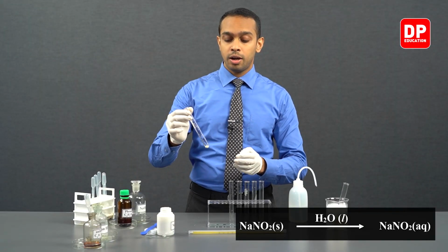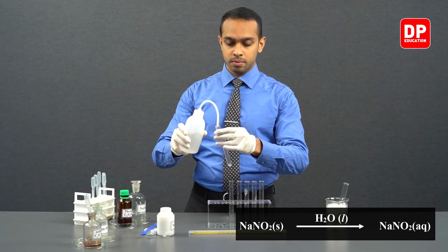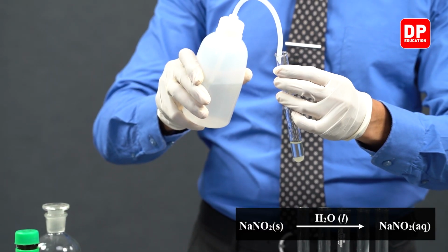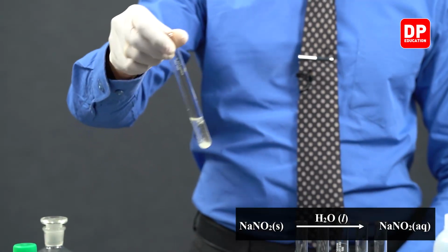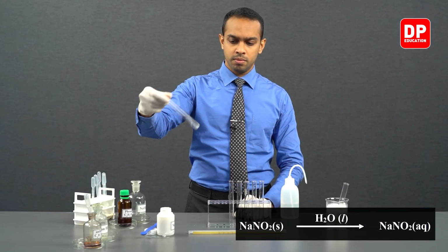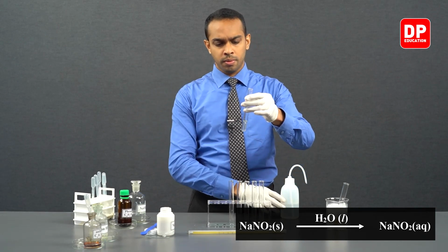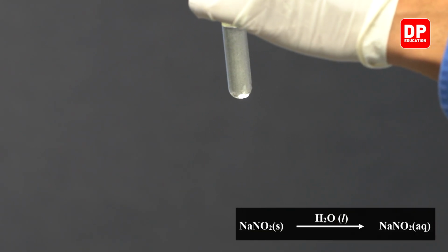And now we'll dissolve it in water. If 2 milliliters of water isn't enough to dissolve it, we can add a little bit more water.